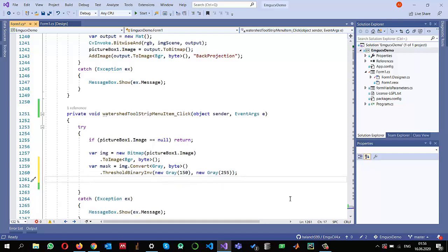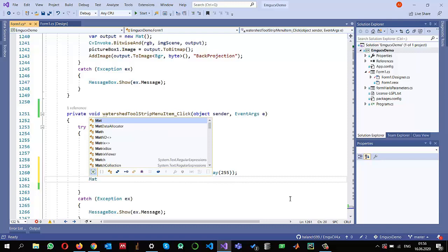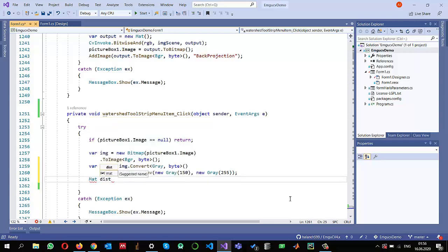Distance transformation gives the distance from a white pixel to the nearest black pixel. This way, the central pixels within the blood cells will have higher values. To store the result I need to create a Mat object called `distanceTransform`.